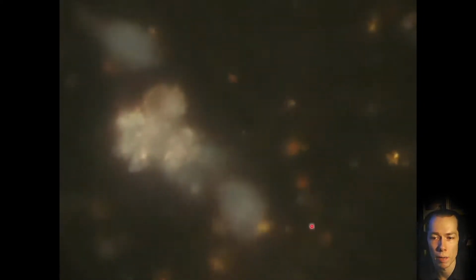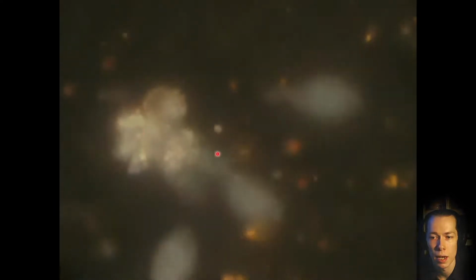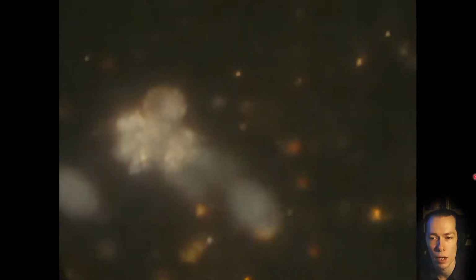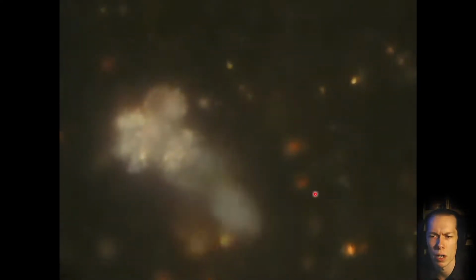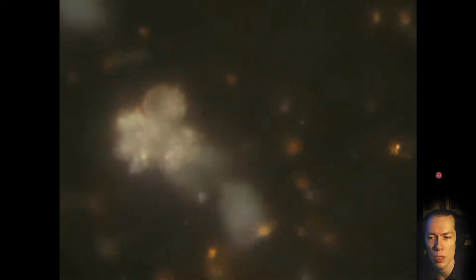So it's a macrophage, one macrophage, a second macrophage, and this is dead cells. And these are gold nanoparticles inside the macrophage. Another macrophage here. They're just eating dead cells because it's their duty. Maybe it's not a macrophage, I believe maybe it's a neutrophil of some kind. But anyway, it's some type of immune cell.